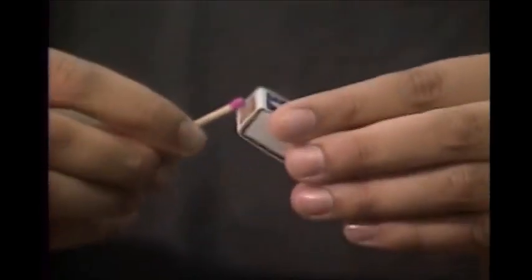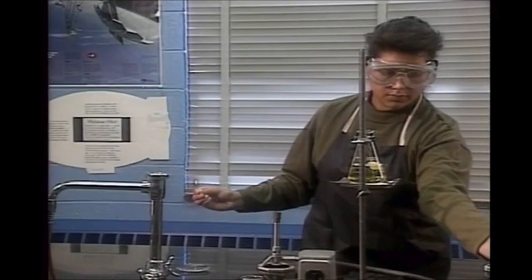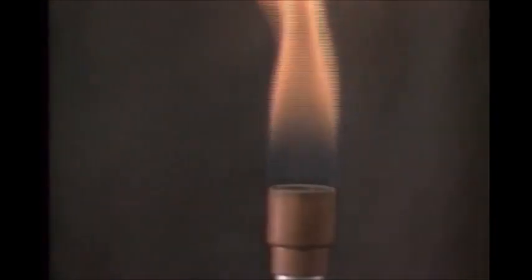When using a match, strike it away from you. Turn the gas on after the match is burning. That way, gas won't escape while you're striking the match. Light the gas from the side so the match isn't blown out.